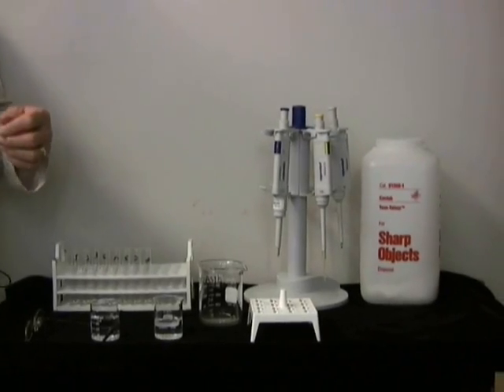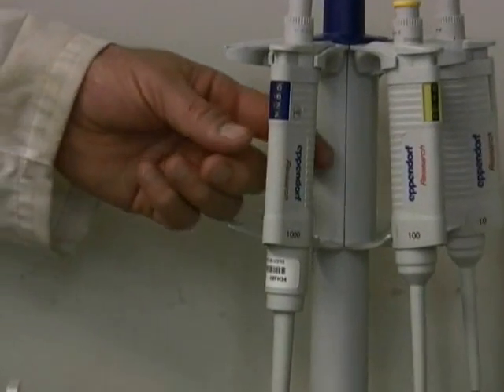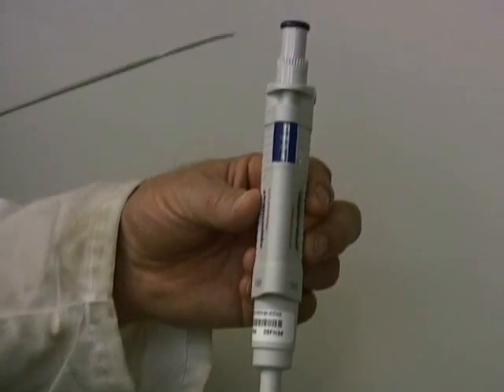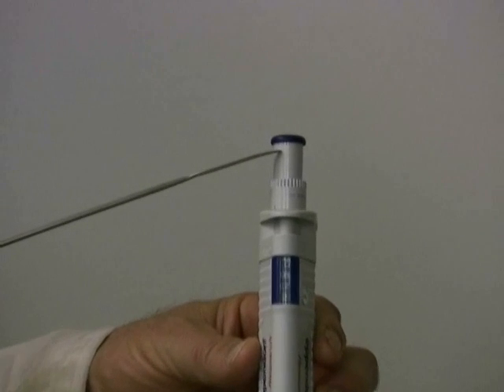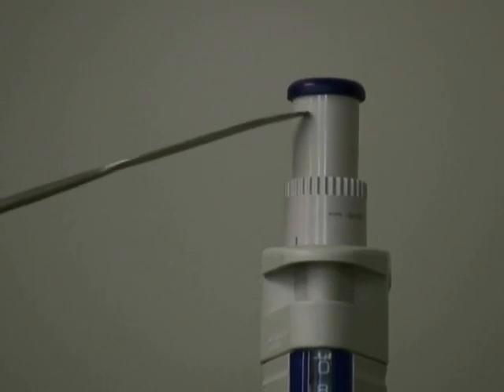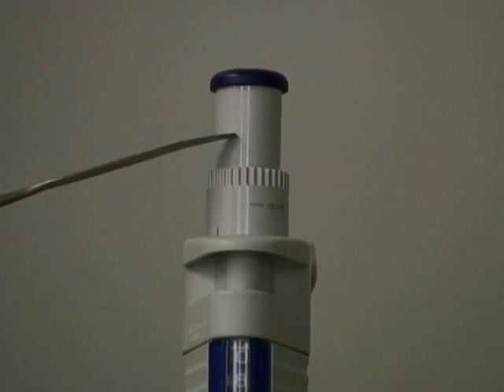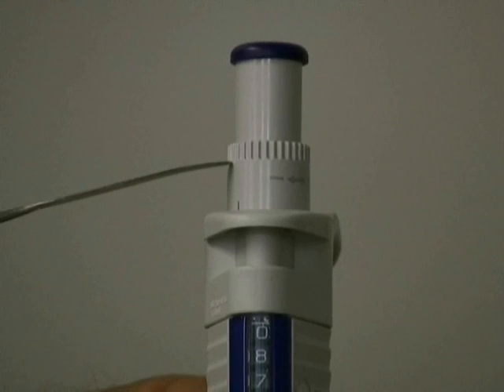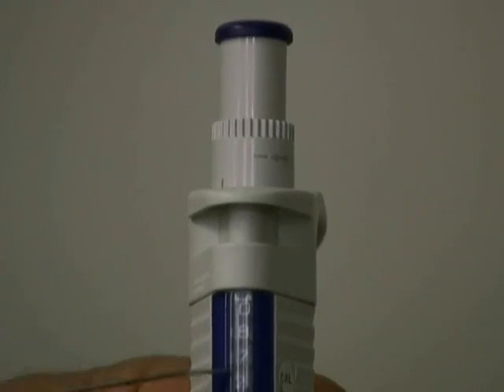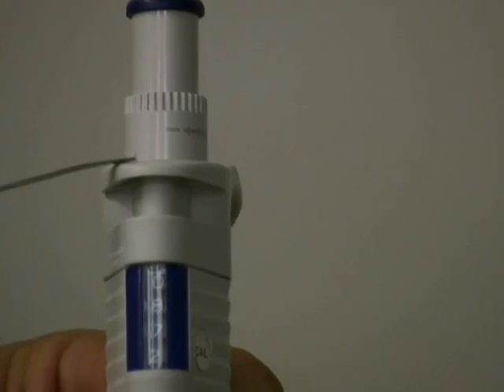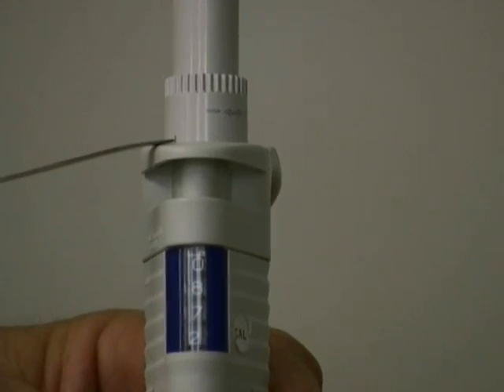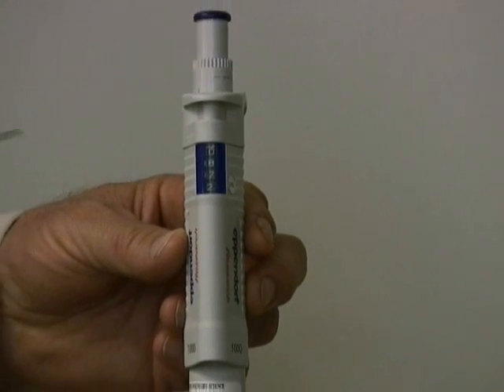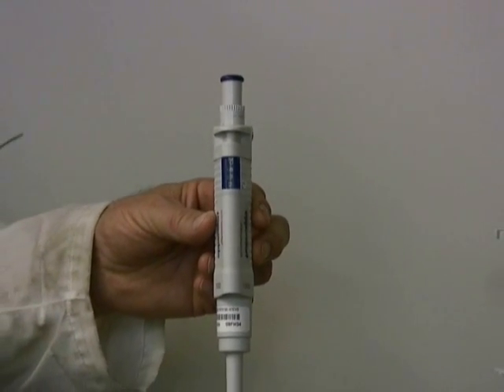Now we're going to take a closer look at the working parts of the pipette. This is your piston, and this is what you'll compress to evacuate the volume that is registered and pick up the sample. Over here we have the dial to change the volumes on the readout, and over here we have the ejector, the tip ejector, when you finish your work. To get an appreciation of the working mechanism, you should look at the animation.